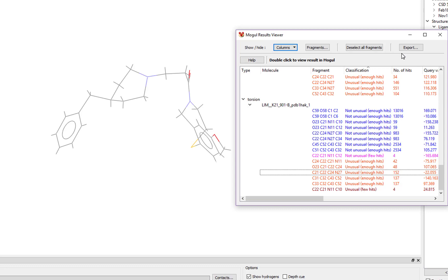Investigating the parameters that are unusual, as flagged by the Mogul geometry analysis, will help you understand if your refinement of the crystal structure is correct, or if there is something chemically interesting going on in your structure.